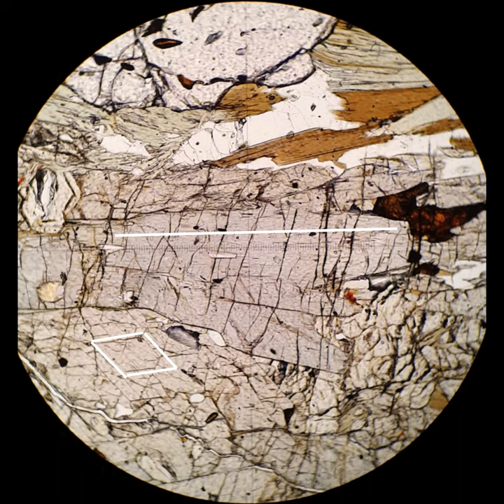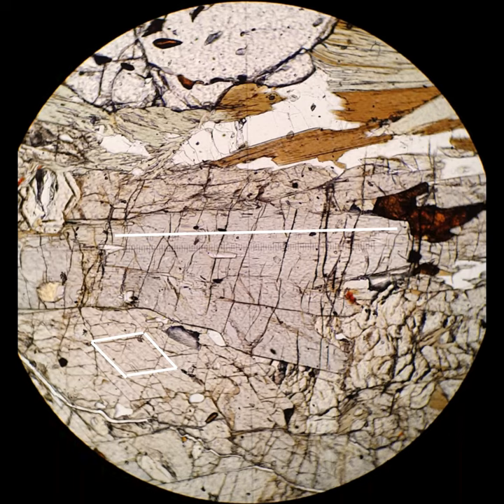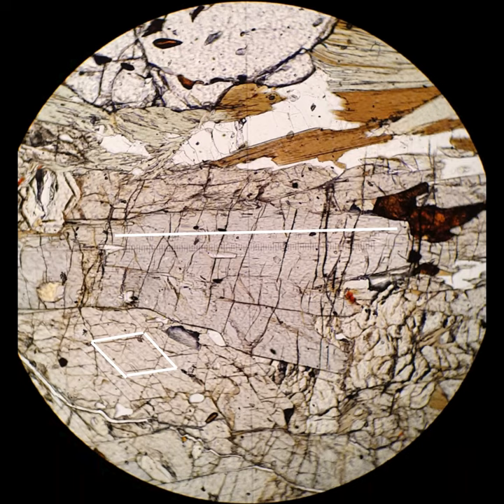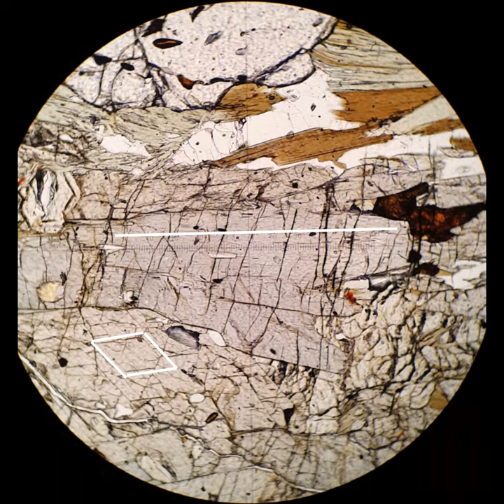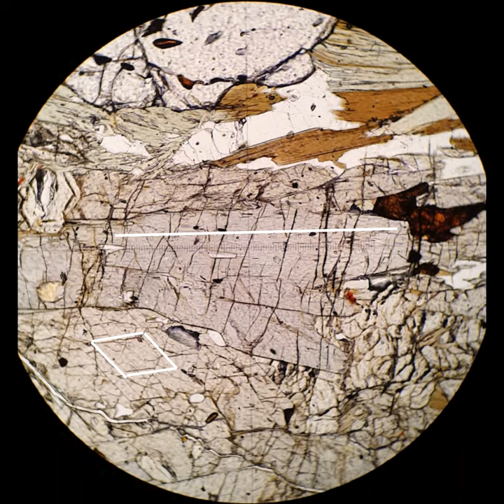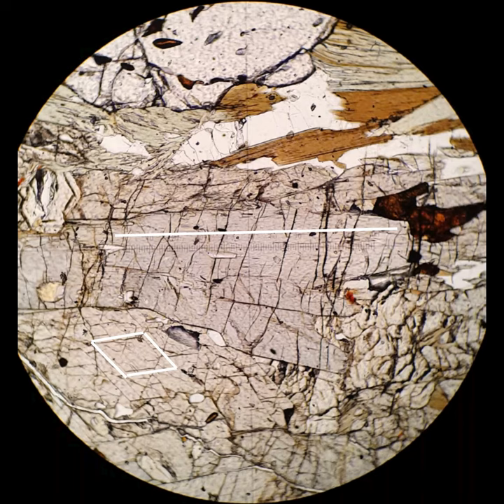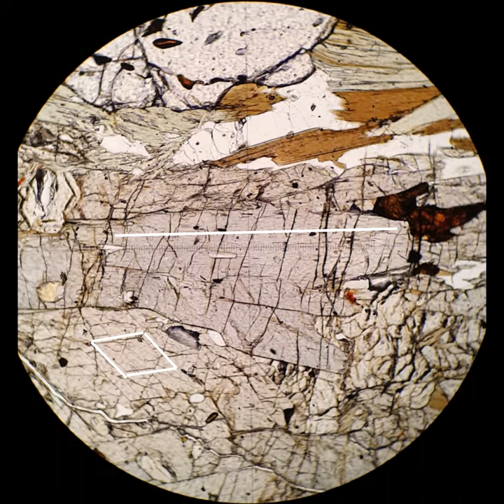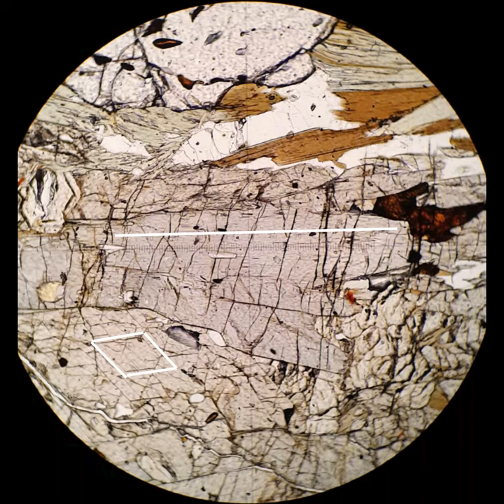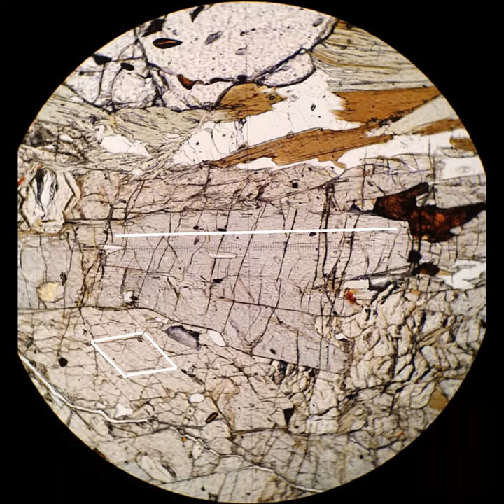I'll stop this to show two different grains. There's one in the middle which is lying elongate in the plane of the thin section, but there's also some good amphibole cleavage that you can see, outlined with the little diamond to the left. Watch those as the video starts with the rotating of the stage.